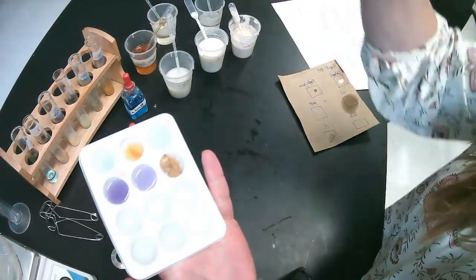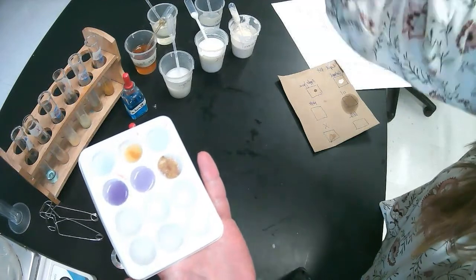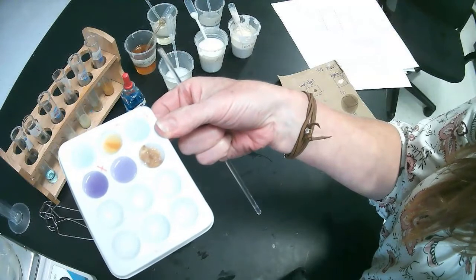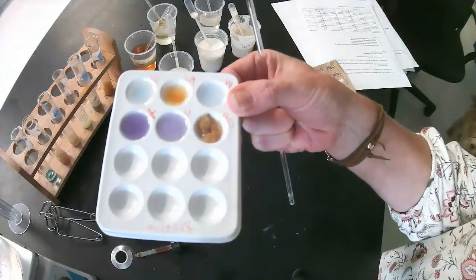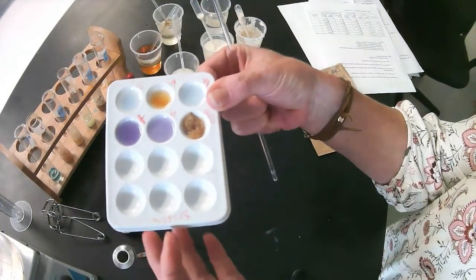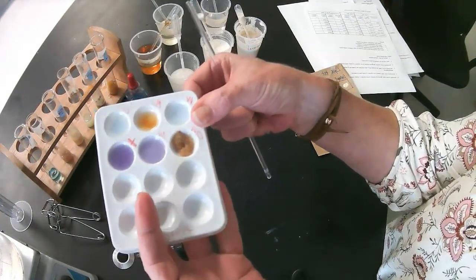Okay, so we have, it's the light. The light's too bright. I'm gonna go dim the light. Hang on, I'll be right back, okay? I'm sorry, guys. Okay, I think that's better. I dimmed the light so there isn't any glare off of the well plate.